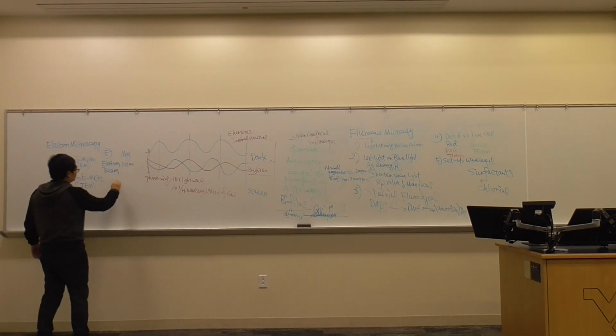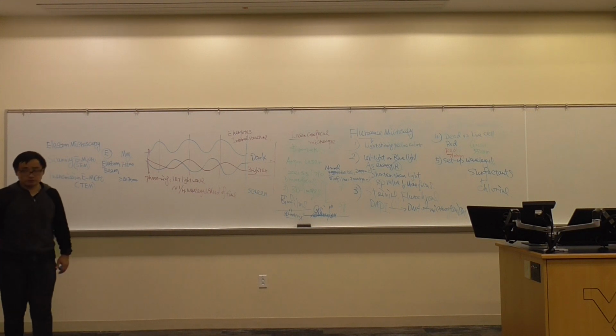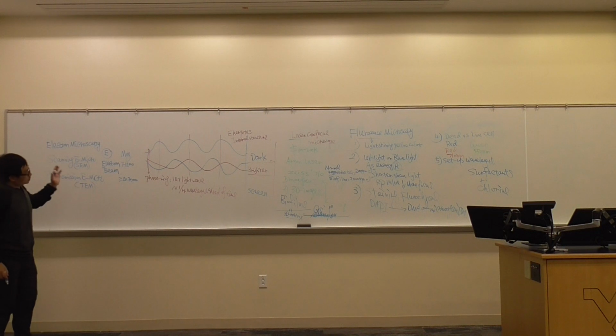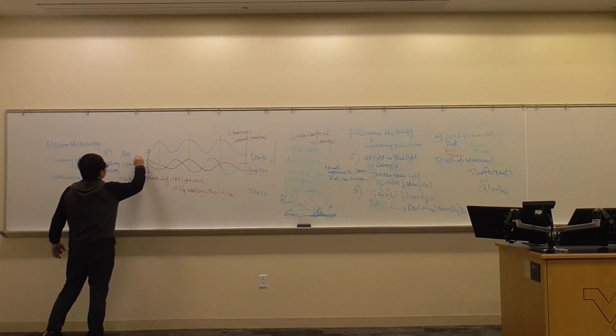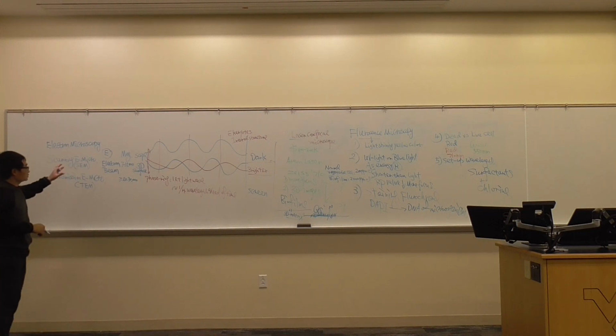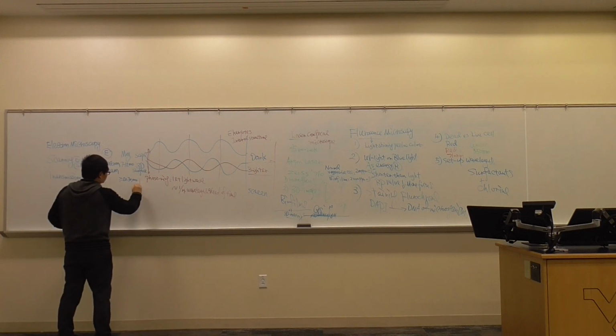Transmission electron microscope, more than 20 to 30,000, and could go up to 100,000. It depends. Now, what are they looking for? Scanning electron microscope, this is a scope, okay? It gives a 3D image of the surface, because the lens goes back and forth over the surface, so we see 3D images. The transmission electron microscope shows the internal structure.